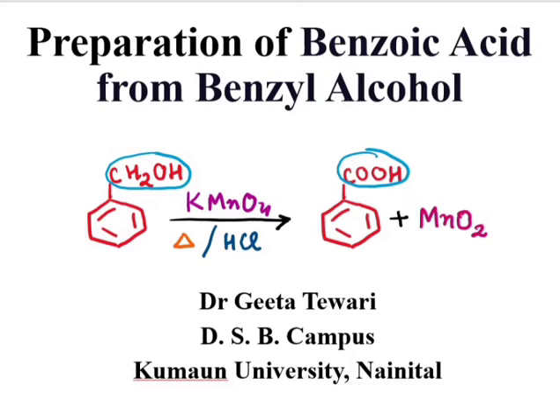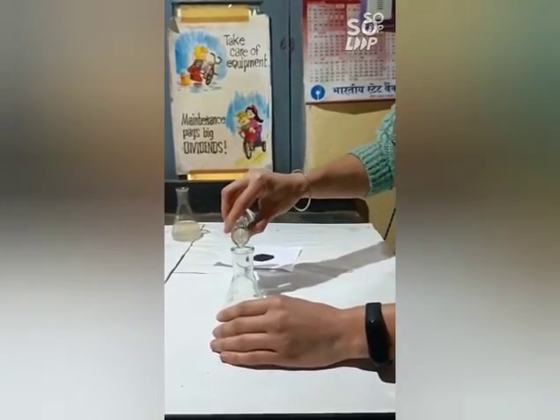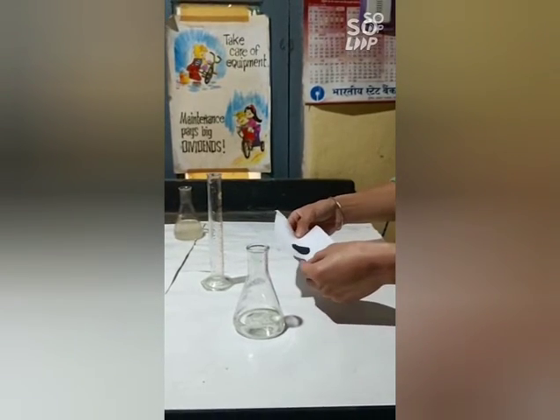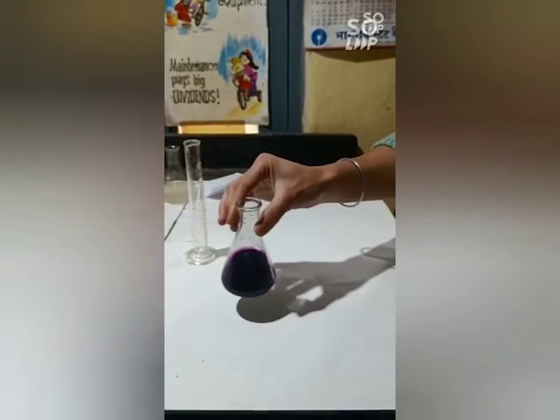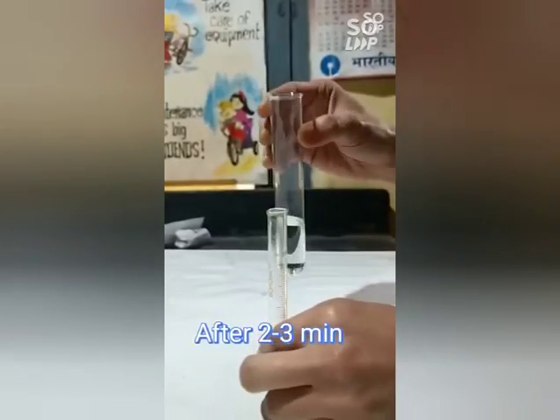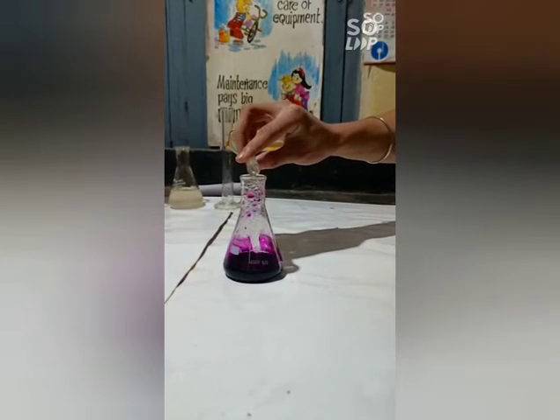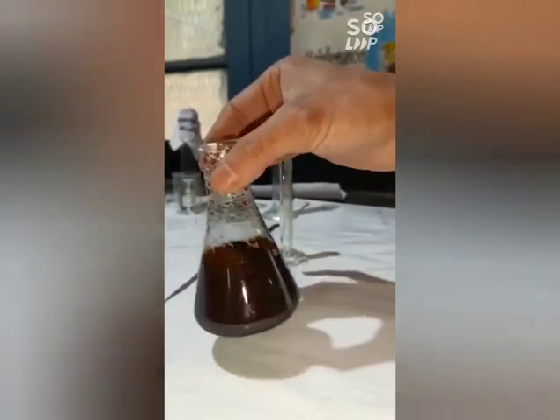This exercise will take about half an hour to complete and we will obtain white colored benzoic acid. Let's start the preparation. Today we are preparing benzoic acid from benzyl alcohol. For this we take a conical flask, add 30 ml of distilled water, then 1.5 grams of KMnO4 (potassium permanganate), and boil this solution on the hot plate. We then add 1 ml of benzyl alcohol.